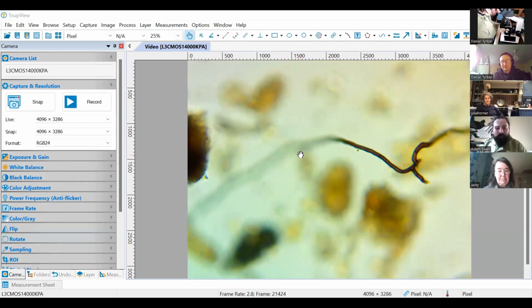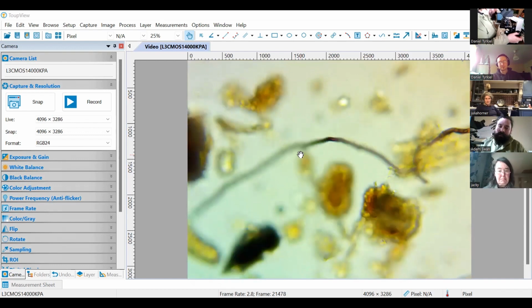Here's another example, just going back to the sample of even septations, even diameter, dark color, all the things we look for in beneficial fungi. And so if we imagine this basically covers the field of view, it makes it very easy to count, right?